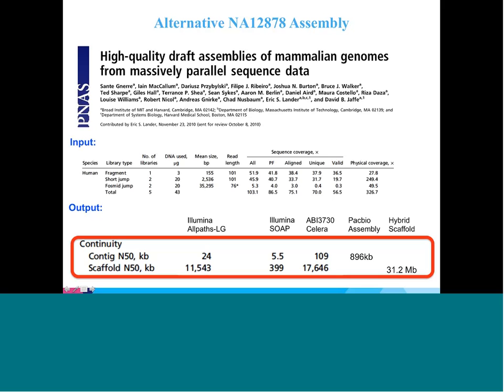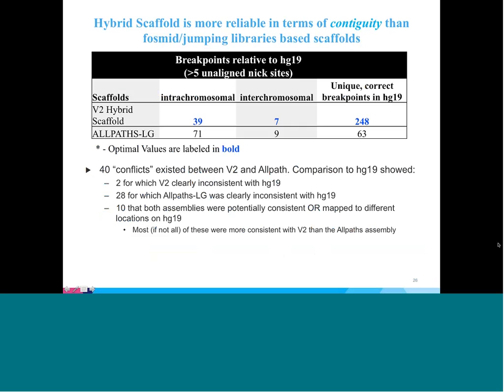So we feel reasonably good about that, but one of the things that, of course, everyone's concerned with is it's not just how contiguous your assembly is or how good your N50 is, but how reasonable is the assembly quality. And again, I'm going to focus on contiguity of the libraries as opposed to the assembly quality. So one thing I will admit is that our sequence level quality is lower than these short read assemblies, and that's something we're continuously working on. And it's quite a bit lower. In our case, there's millions of indels that we miss.